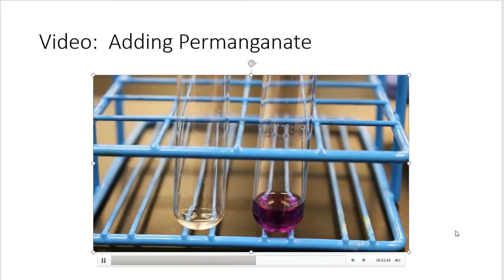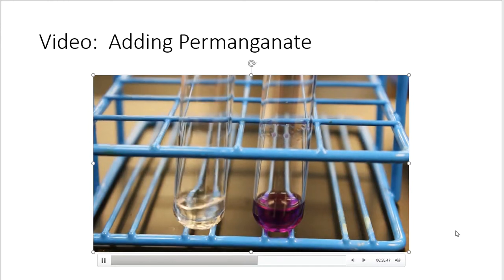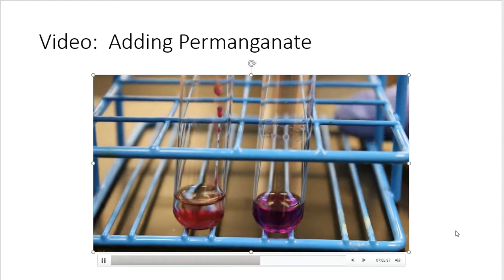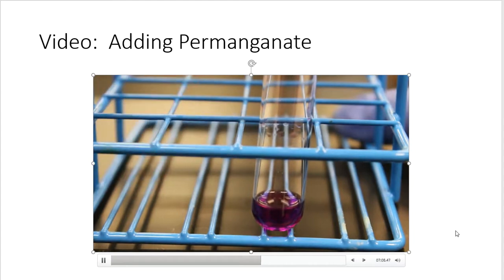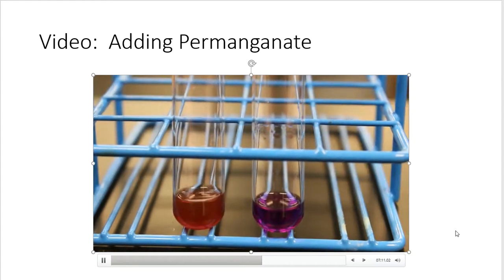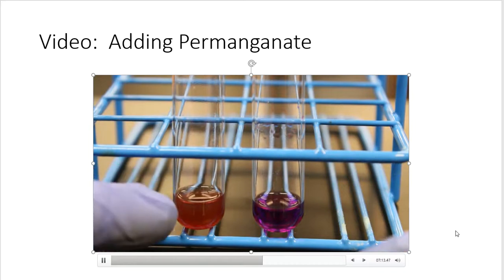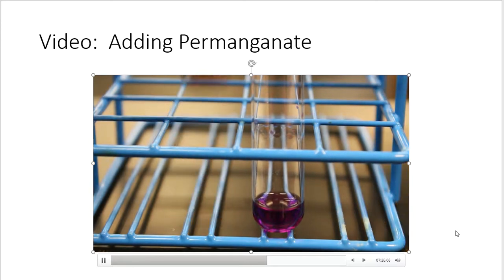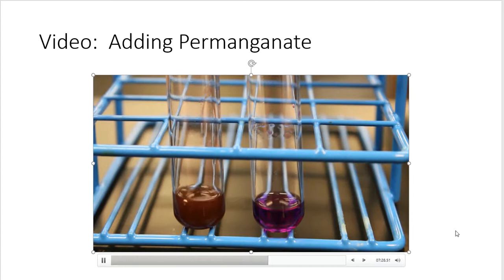Next up, cyclohexene with an ENE. 1 ml of acetone, 2 drops of permanganate. I'll give it a shake. And there you go. So again, we're looking for this color and this color to match, and at 2 drops it did not. So I'll keep slowly adding because the procedure actually tells me to do this. So 3, 4, give it a shake. It's just muddy brown.